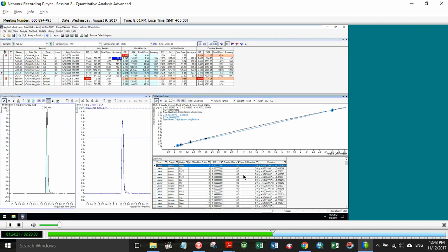Yeah, and we can activate as many of these filters as we want all the way across. So if I only want to see linear ones, and say I care about the weighting, and say none.